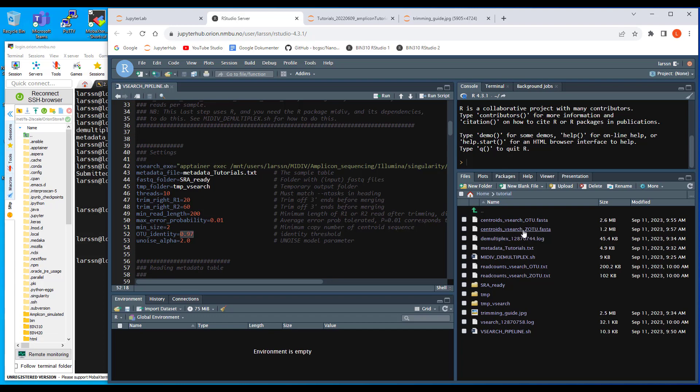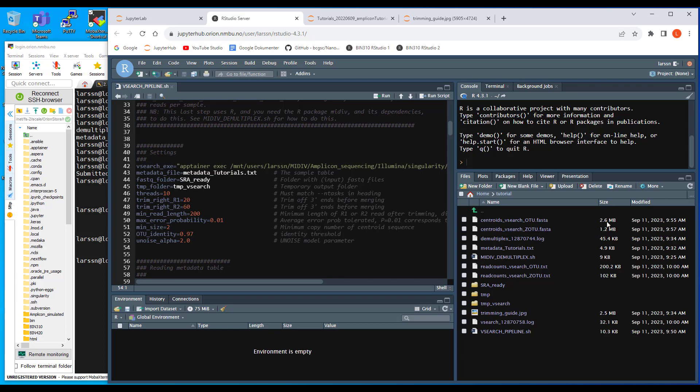And the other one is the unoise denoising processing resulting in this fasta file. This number of ZOTU's, as we call them. And here is the setting for that ZOTU. We rarely change this one. We can see from the sizes here that the number of ZOTU's is much lower. It's less than half the total number of OTU's up here.